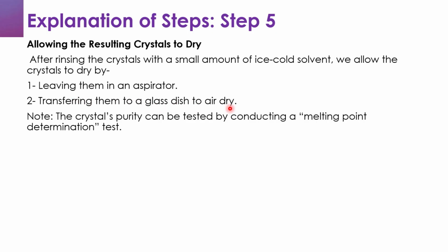We also have to note again that the crystal's purity can be tested by conducting a melting point determination test, and we are not going to look into this in detail.